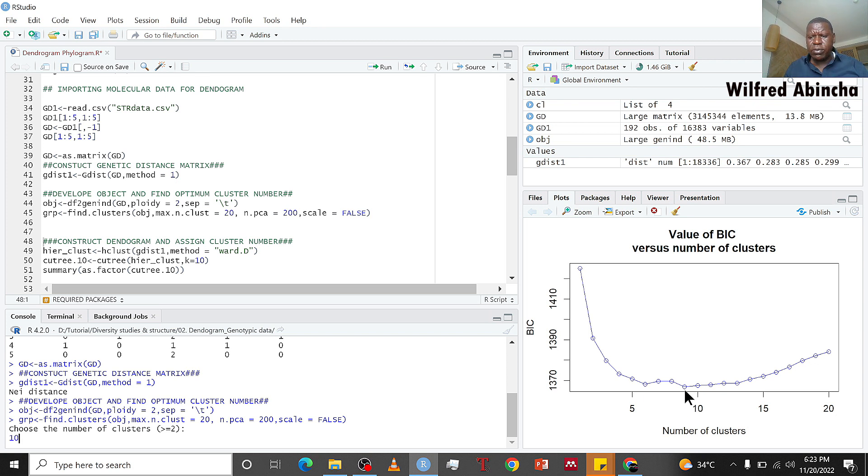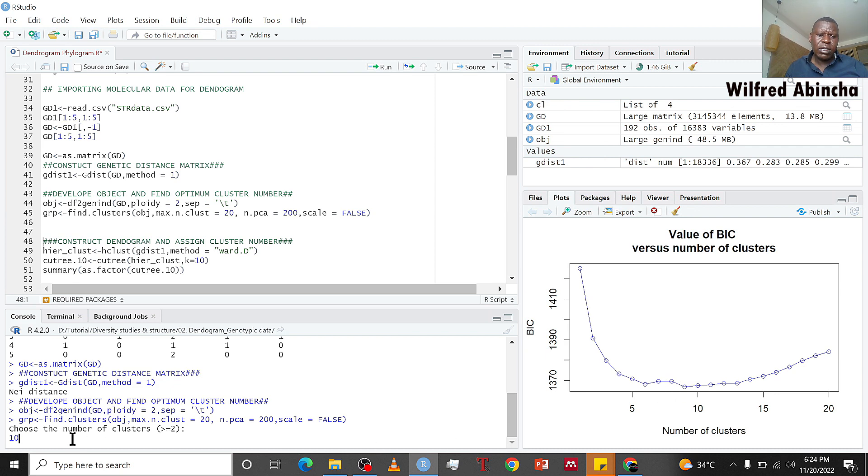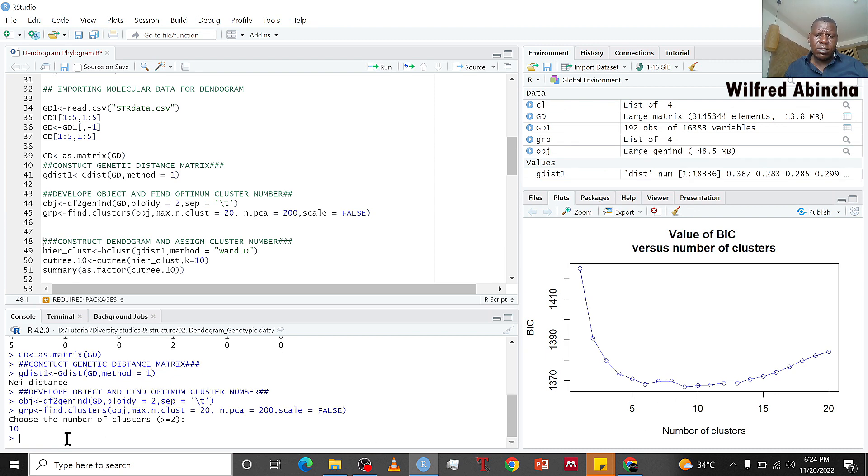I selected 10. That's why down here when you choose the number of clusters, I choose 10. You can put nine because the lowest BIC is nine, but you can add one or subtract one. So I write 10, then you press Enter on your keyboard to select that.